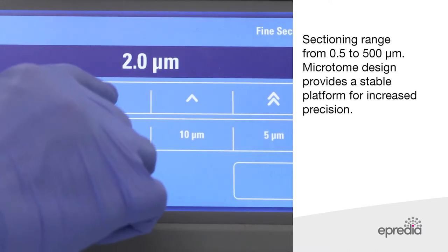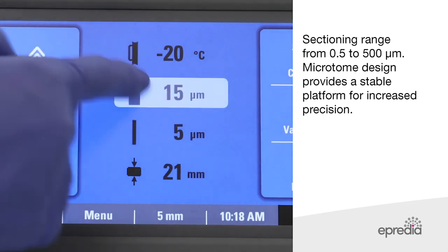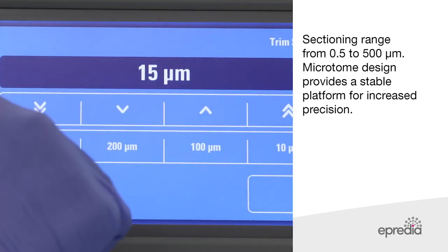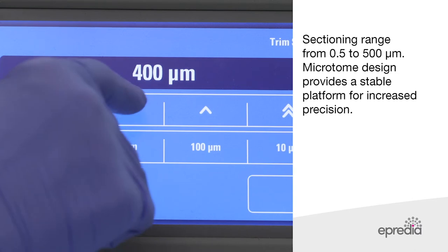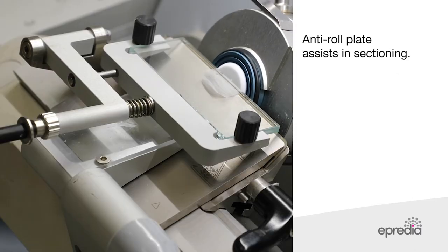The sectioning range of the NX50 is 0.5 to 500 micrometres. The NX50 microtome design creates a stable sectioning platform for increased precision, and the instrument has an anti-roll plate to assist with sectioning.